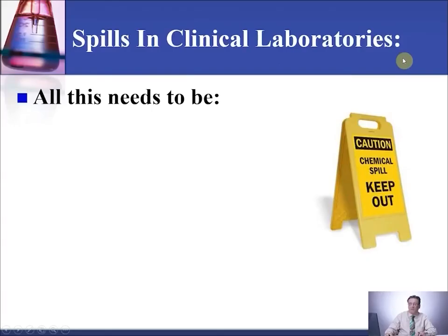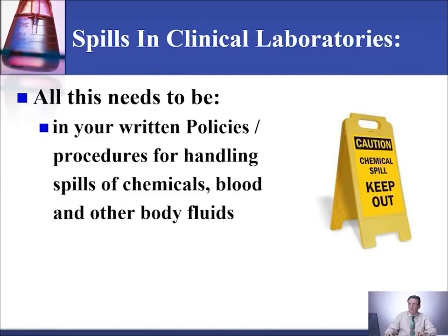All this that I talked about needs to be applicable in your written policy and procedures for handling spills of chemicals, blood and body fluid.